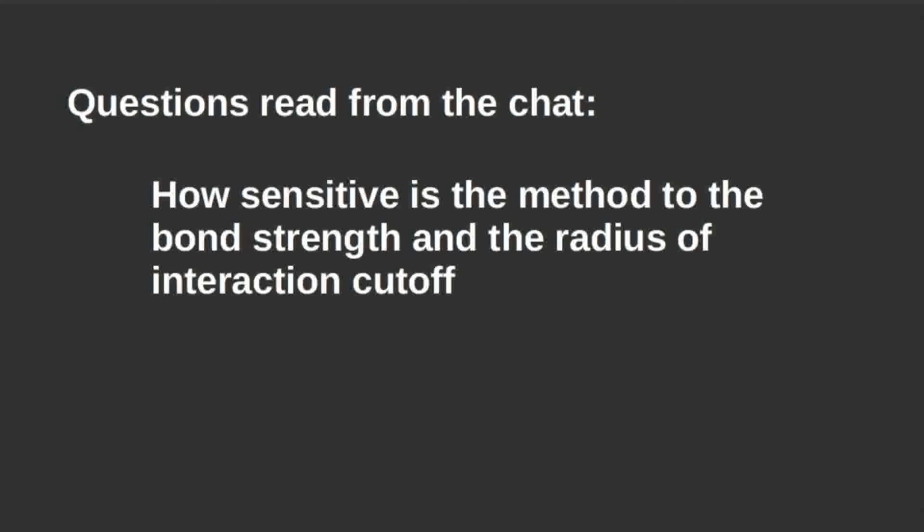When I say atoms, I mean also pseudoatoms, I'm interchanging both terms. If you see such effects, then this means that there is something wrong with the cutoff, so you need to change it.